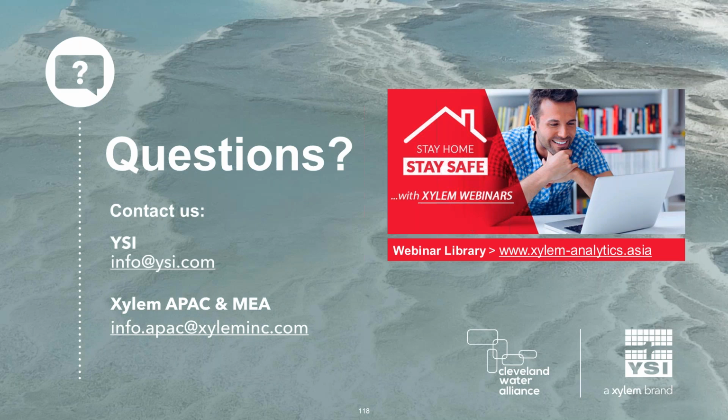Yeah, absolutely. That's a great question. Yeah, certainly, and YSI has several options for conductivity sampling meters. I know in this presentation I largely focused on the ExoSonde monitoring platform, but as I did discuss, a lot of the principles of operation for these sensors are pretty much identical. There are differences in the two EXO sensors, the wiped and the non-wiped.